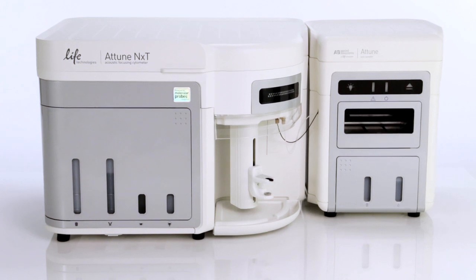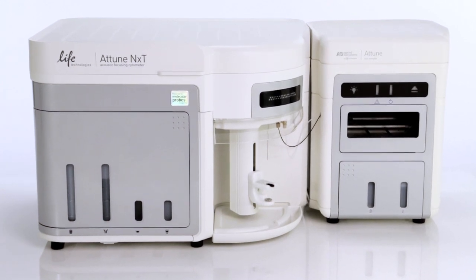Versatility and upgradability are major factors for customers in choosing cytometers. Having four to fourteen color channels and one to four lasers with field upgradable options enables the customer to buy an instrument without having the fear of it becoming obsolete or their research outgrowing it.